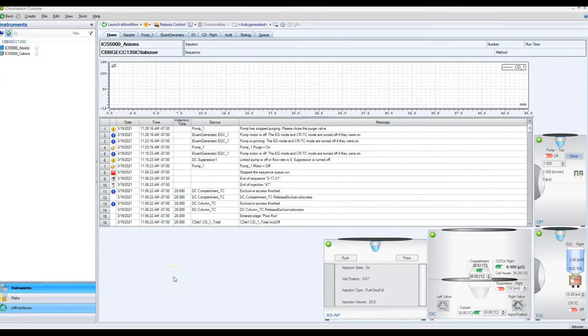Welcome to the Chromelion software. Here's the home screen — you can see three main tabs at the bottom: Instruments, Data, and E-Workflows. E-Workflows is not important for us. The Instruments tab is how we control the instruments. You can see there's an anions and a cations instrument — they run as completely separate systems, not connected in almost any way other than by this software.